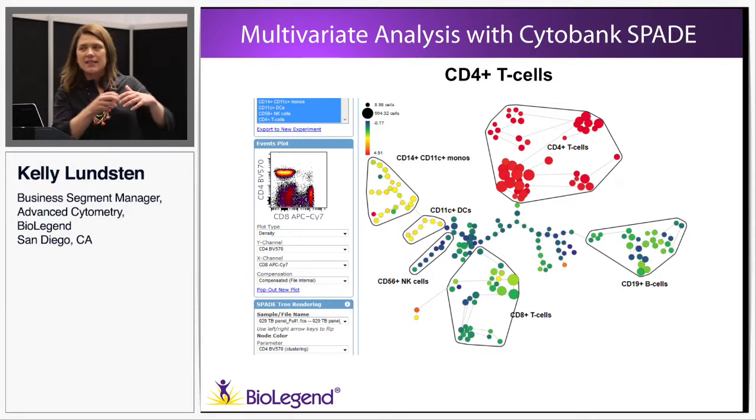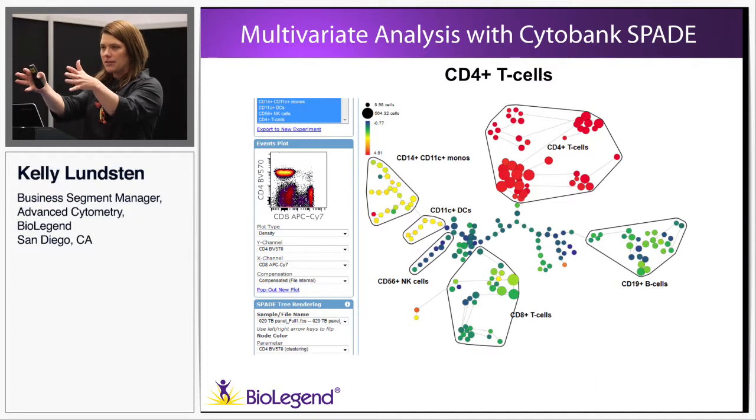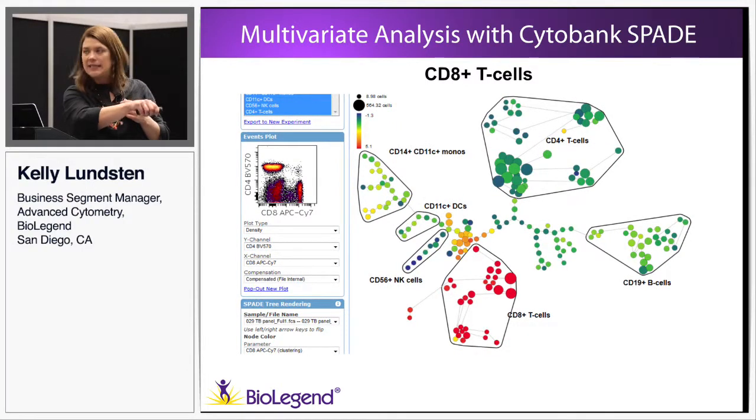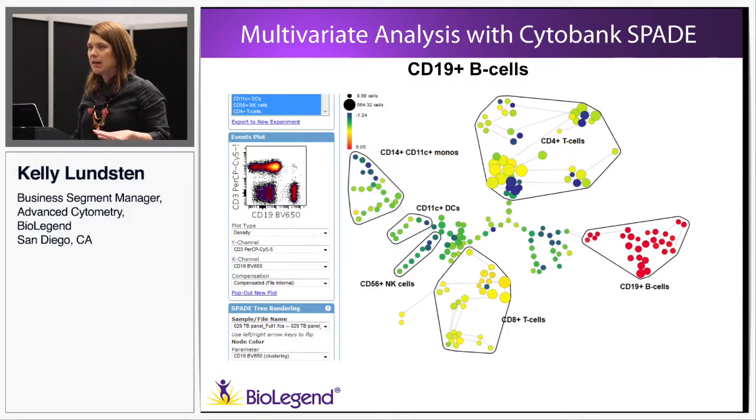That means that we allowed a large degree of binning. What we start with is a more macroscopic level. We say, hey, I'm feeding you all of these parameters from this flow file. The only thing we're excluding before we get to the first step are our granulocytes and our dead cells. Everything else, we're asking the software to pick out by itself, to cluster the meaningful co-expressed information together and then align it on the tree. So in this instance, we begin by clustering CD4, CD8, and CD19, right? That's one family. This is only a T cell and a B cell panel.